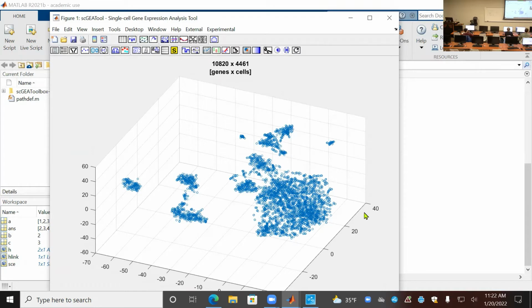Okay. Messing with it on my computer. That's okay. You just do that again. Restart. It's okay.